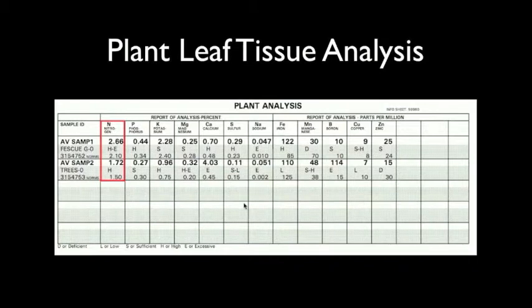So phosphorus, we touched on that already, but they're showing high levels on the turf side. Is there any negative aspect? Not really. By the way, I should mention that the tissue samples that were tested for these two samples came from leaves, not roots. We can also do root tissue analysis, which would show probably a higher level than we see on the tissue. But phosphorus is metabolized and transported to leaf tissue, where it's used to help in the transport mechanism throughout the plant, because it's predominantly in the roots, and the phloem and the xylem, which are the transport mechanisms, have heavy amounts of phosphorus in it, and that relates to what we see in the leaf tissue.